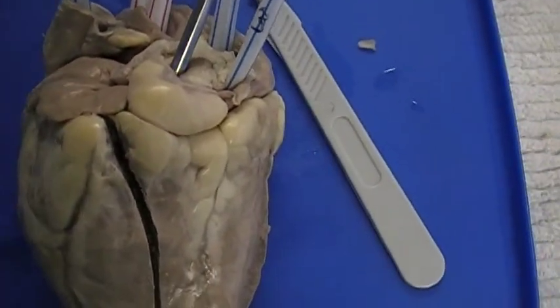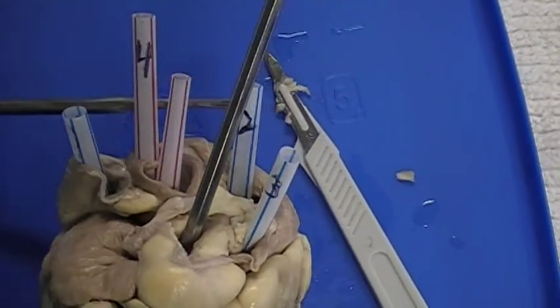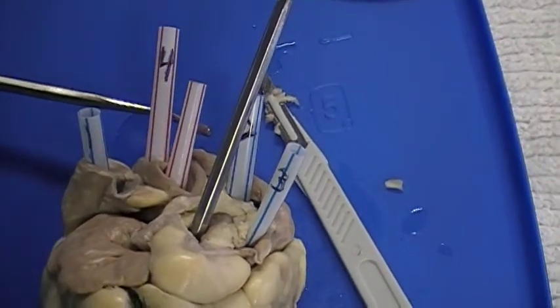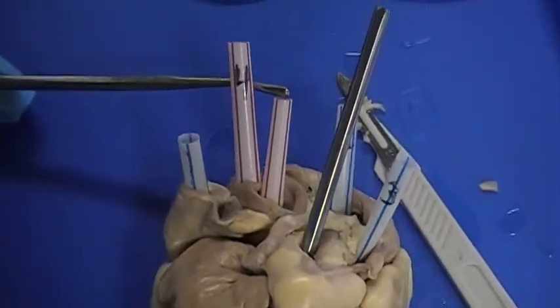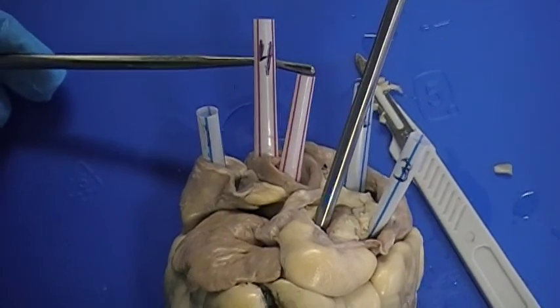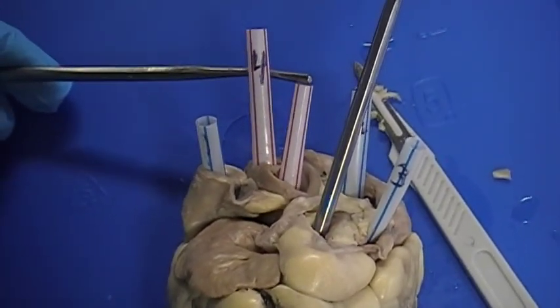Oops, and I kind of rubbed that off. The aorta is 4 right here, and kind of the other one that is attached to it. And this blood is coming from the left ventricle and is sending blood to the capillary beds of the body tissues, and this blood is oxygenated.